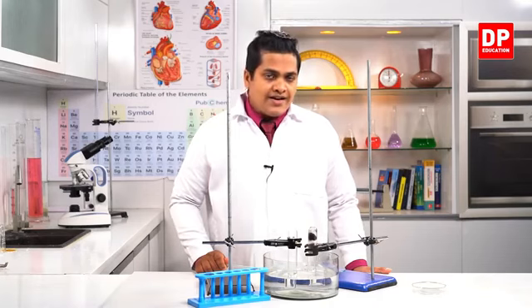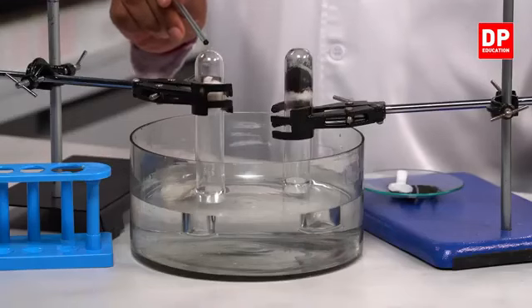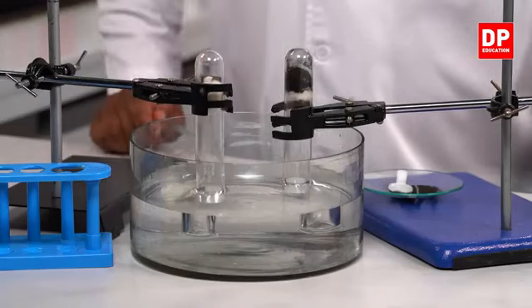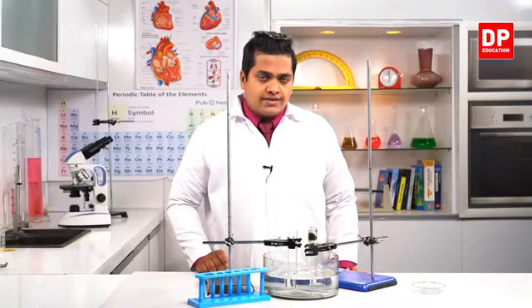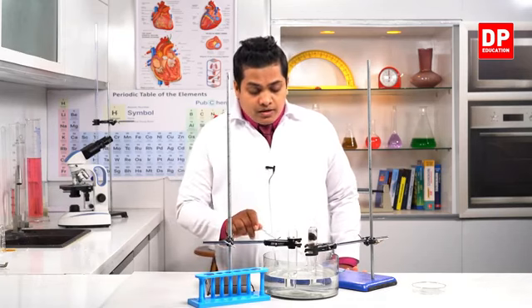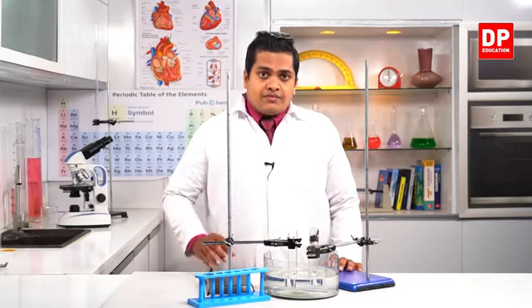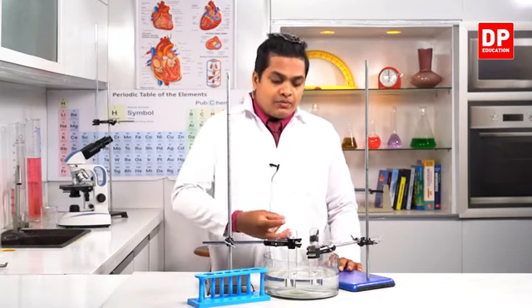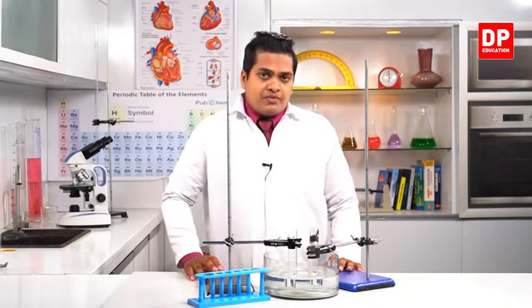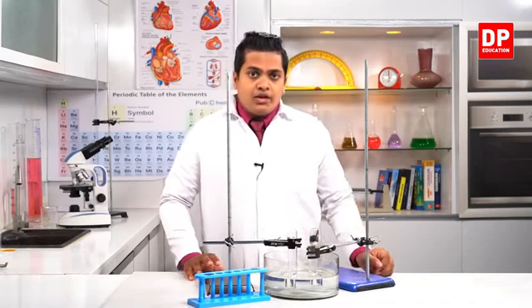To compare and get an idea about the volume which has risen, we have used this second boiling tube. After the rusting process starts, some gases are absorbed by the rusting process, which means some water should rise up through the boiling tube.